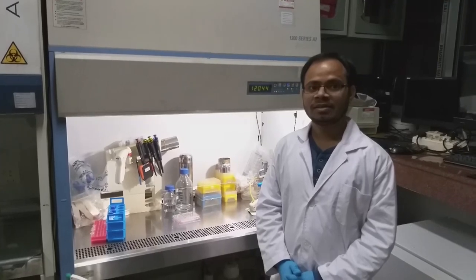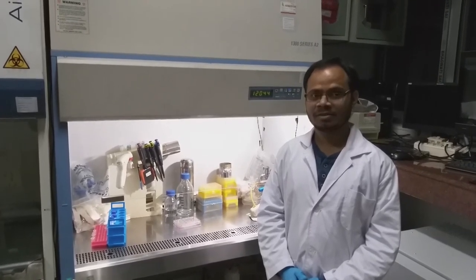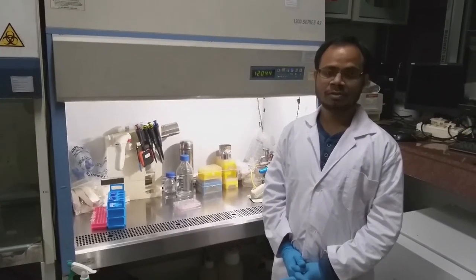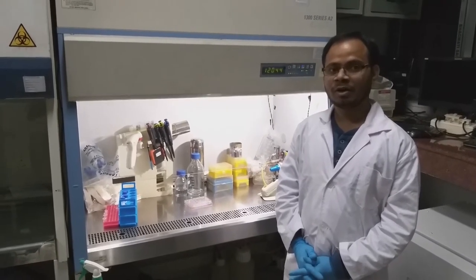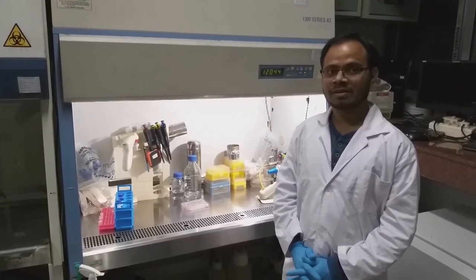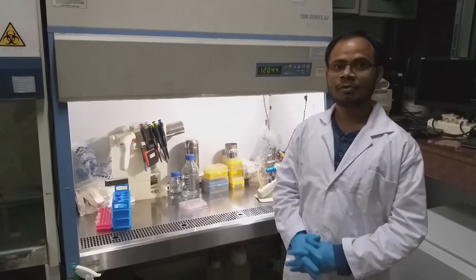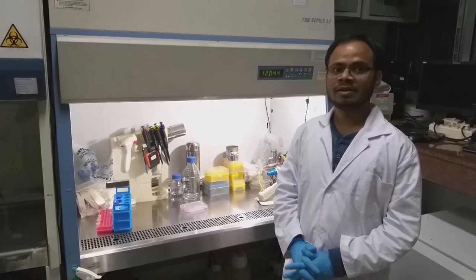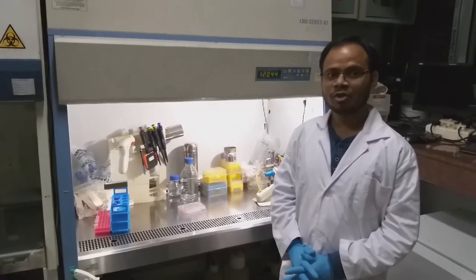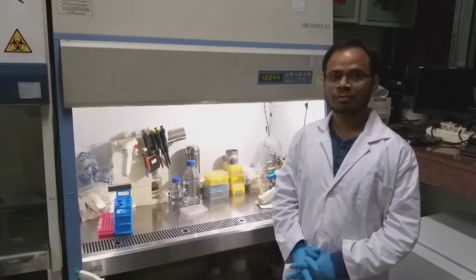In the chemical transfection method, there is a wide variety of choices available, like using cationic lipids or peptides or polymers. In this method, we are going to show PEI based transfection. For that, we have to mix DNA with the incomplete media first. After mixing, we have to add polyethylenimine directly to the mixture. Then we can see a visible white precipitate, which means the DNA is complexed with the PEI and ready to go. The ratio between DNA and the transfection reagent should be 1:4.